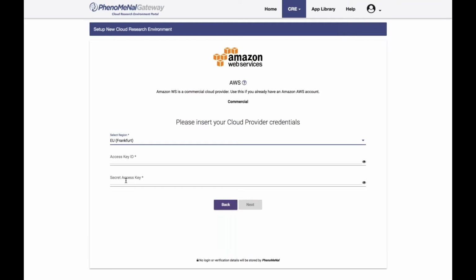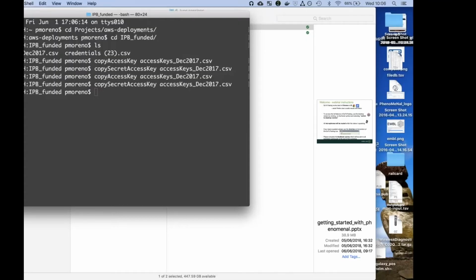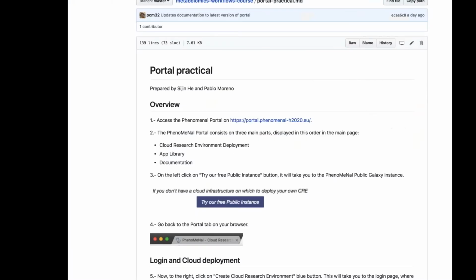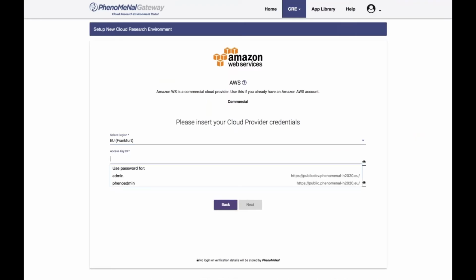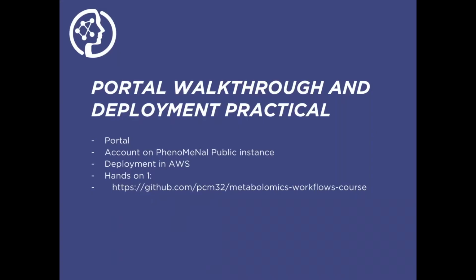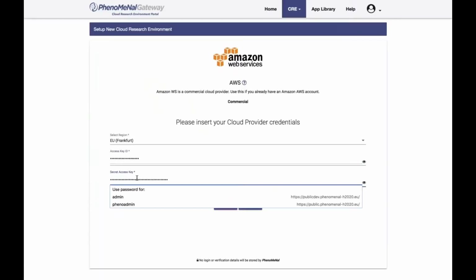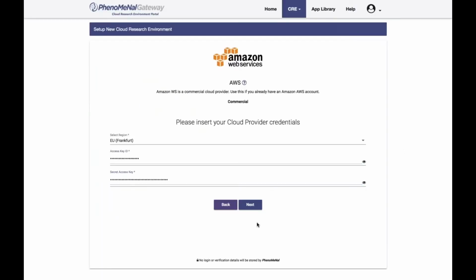I will briefly copy my credentials. Okay, I will press next.